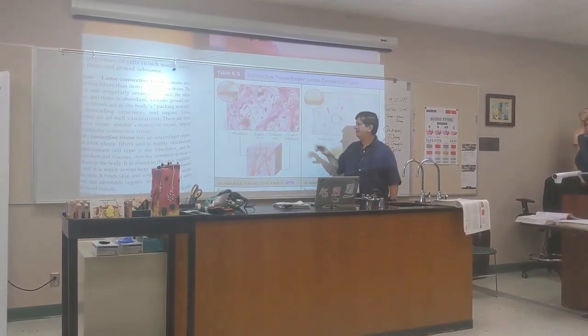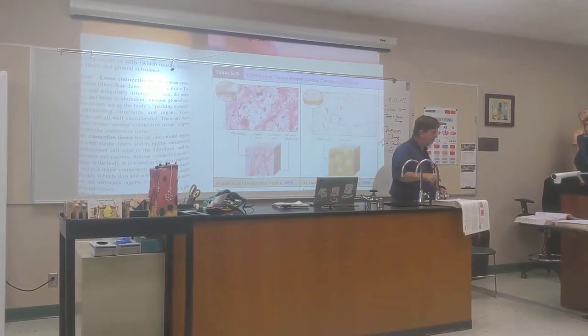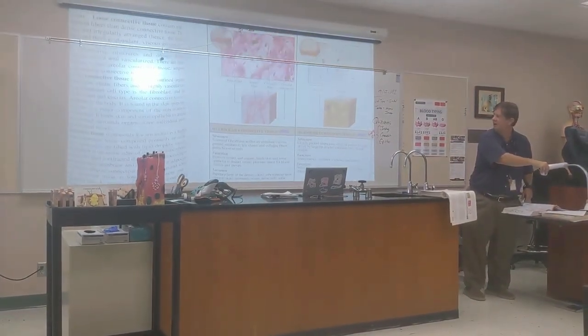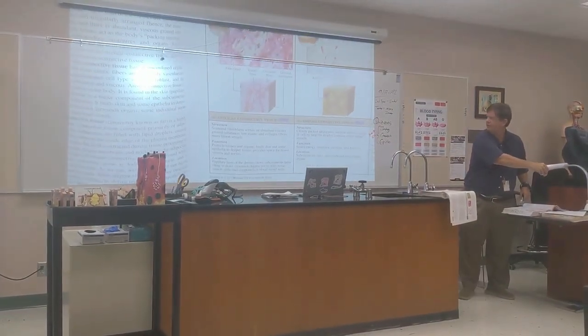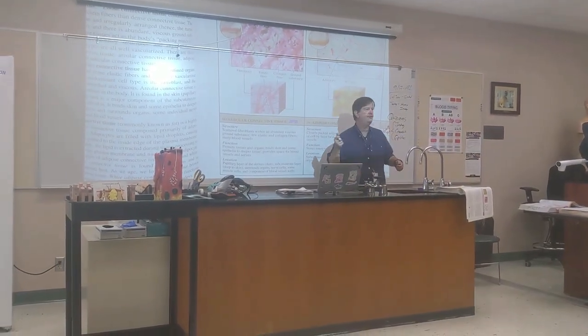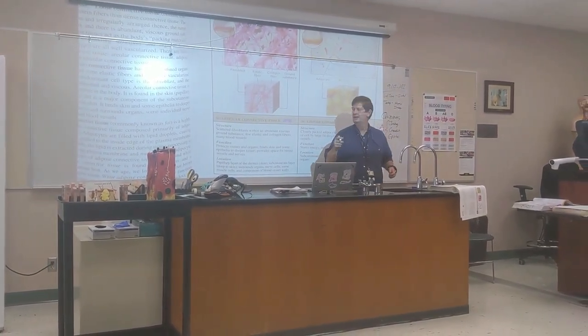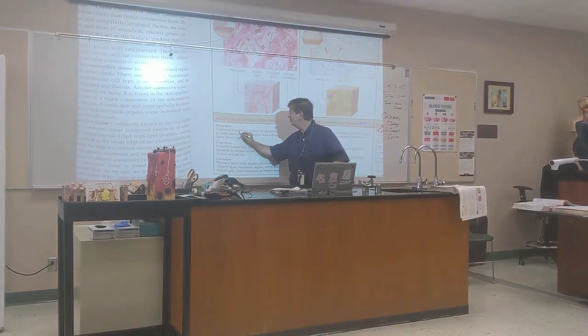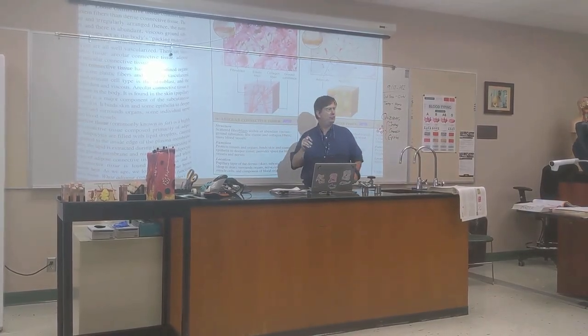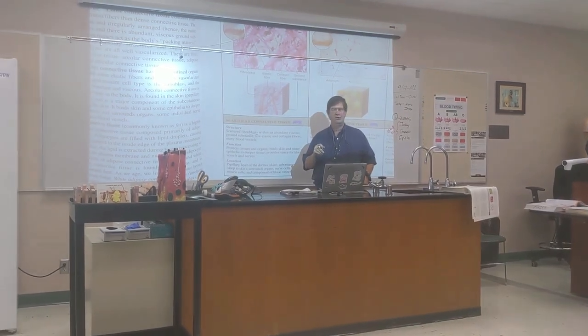Okay. This is areolar connective tissue, and let's just do what they say right here, talking about it. Structure. Scattered fibroblast. Oh, we're going to introduce a new suffix. Everybody ready for this one? When you see blast, I'm going to give you 2 words that I want you to think of.